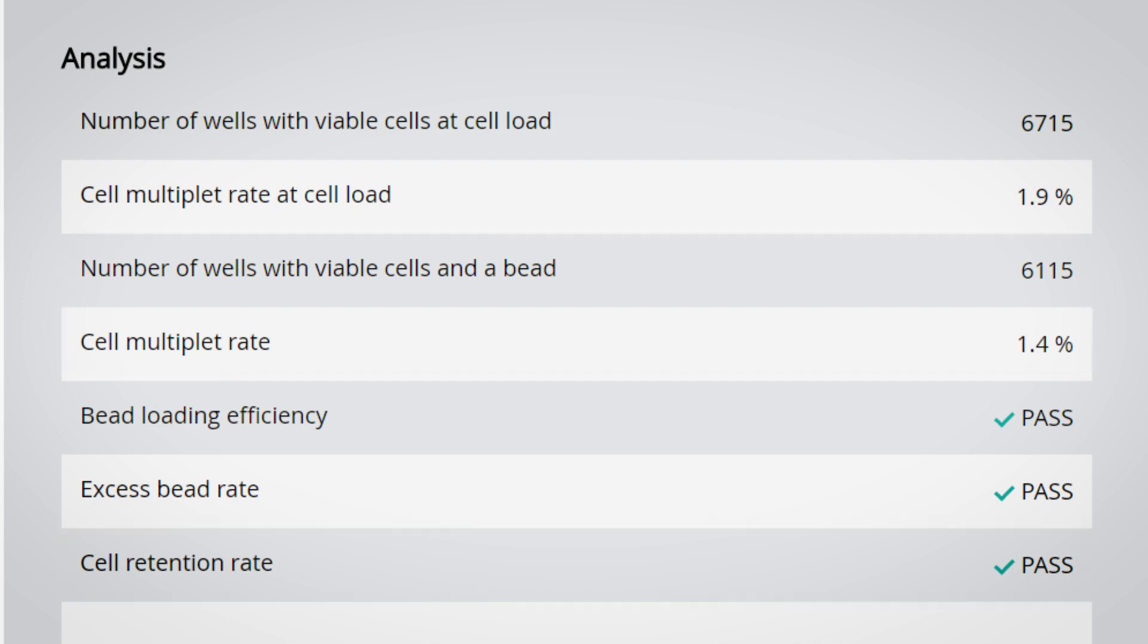However, if a large portion of the cells were lost at this stage, indicated by a not-passed cell retention rate metric, the experiment can be stopped and sample pre-processing can be further optimized.